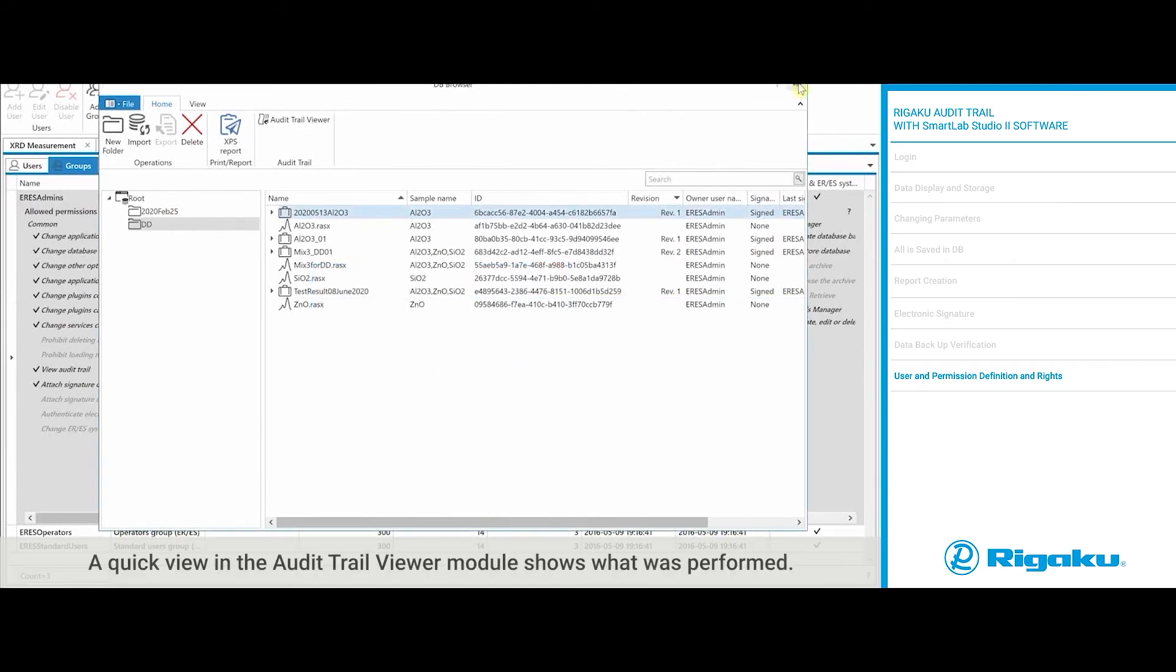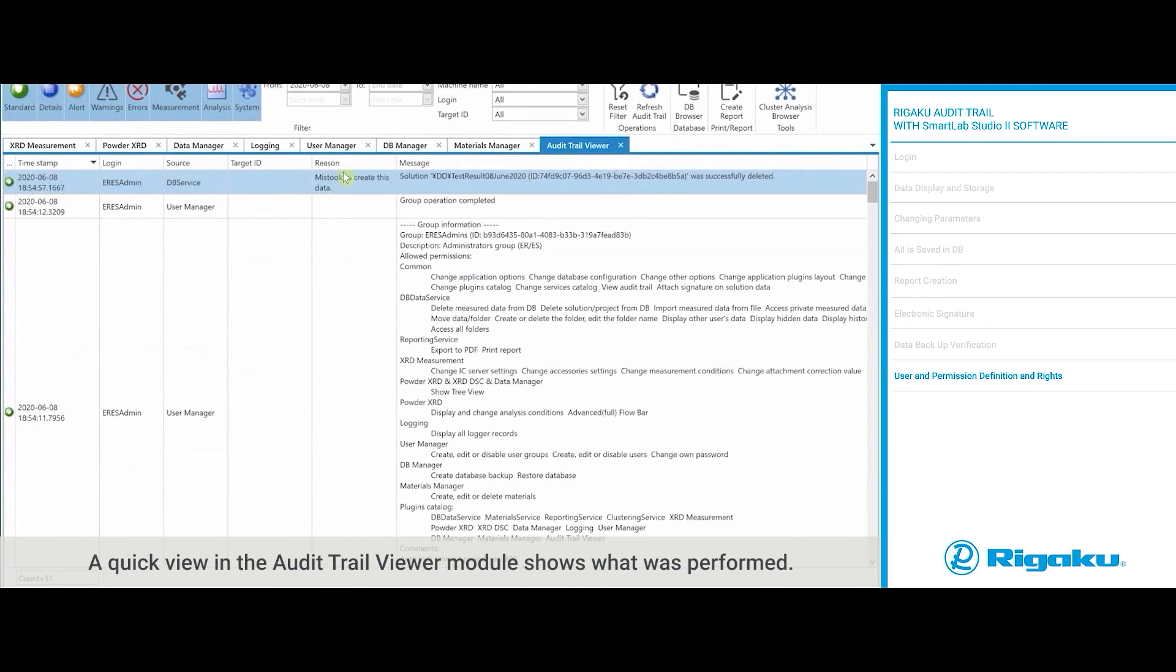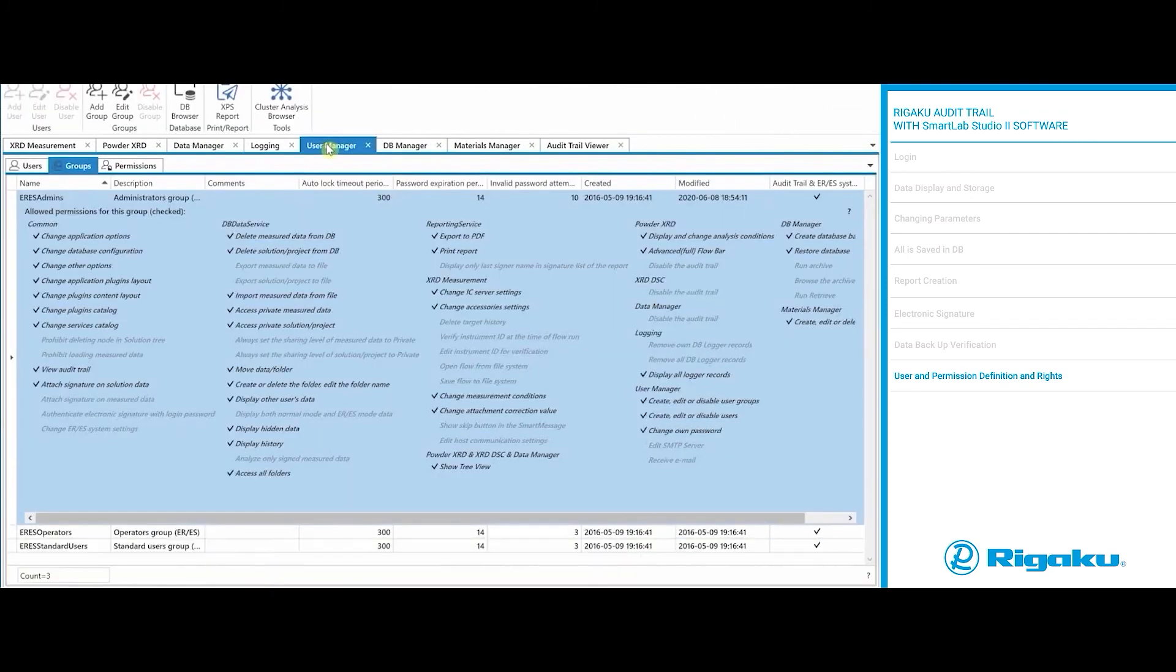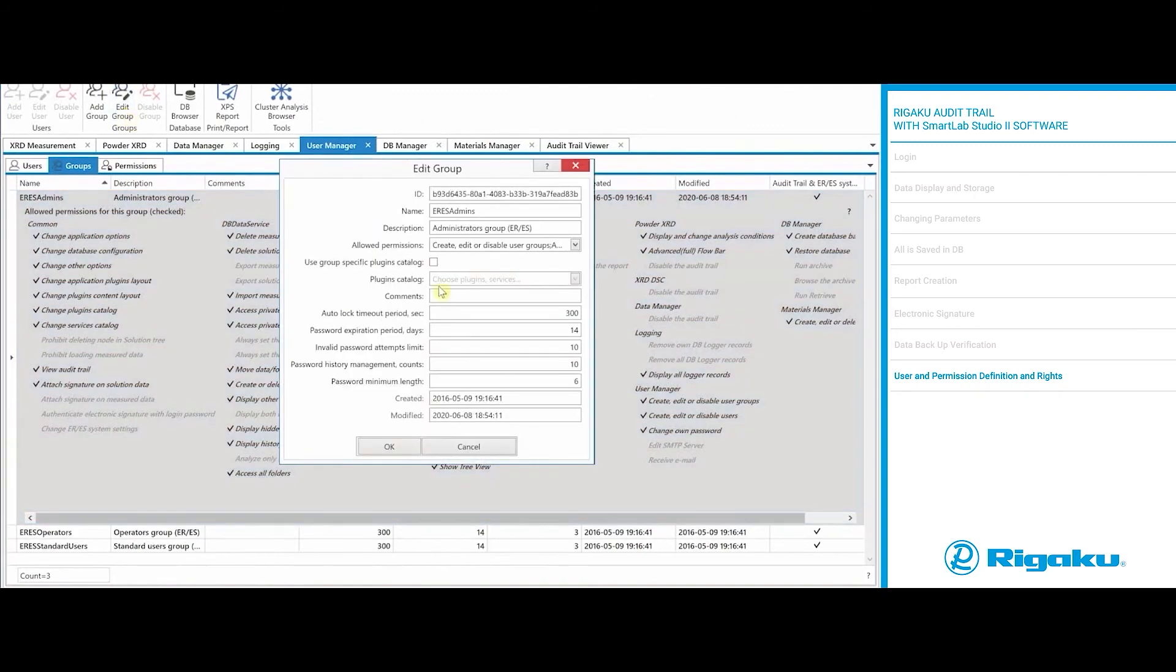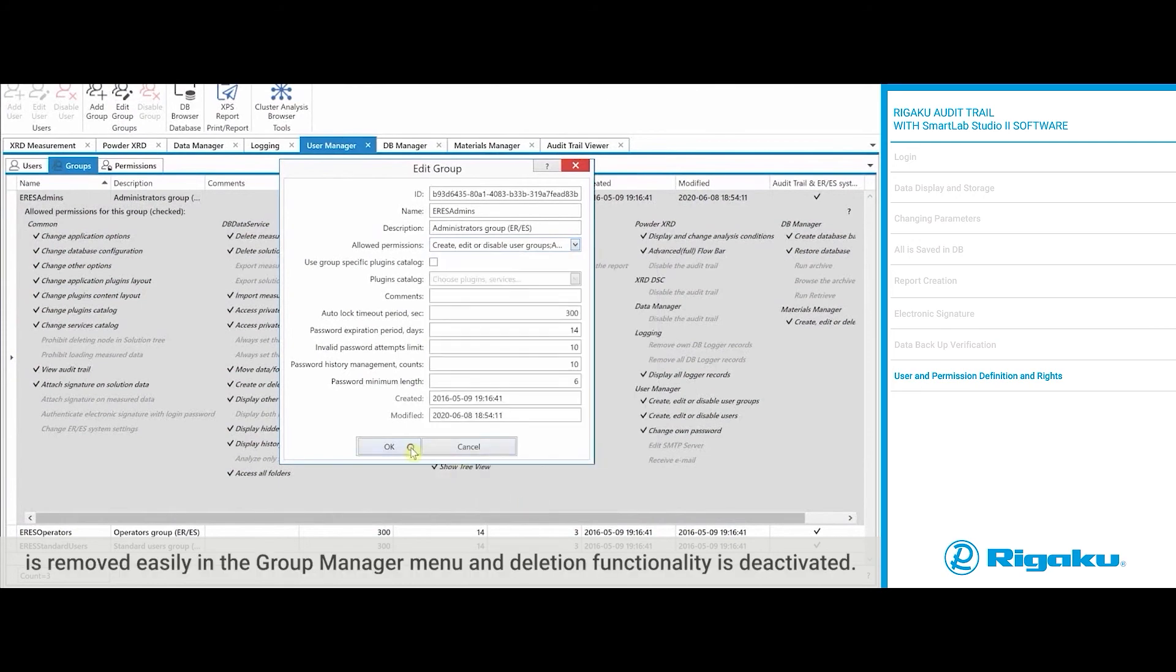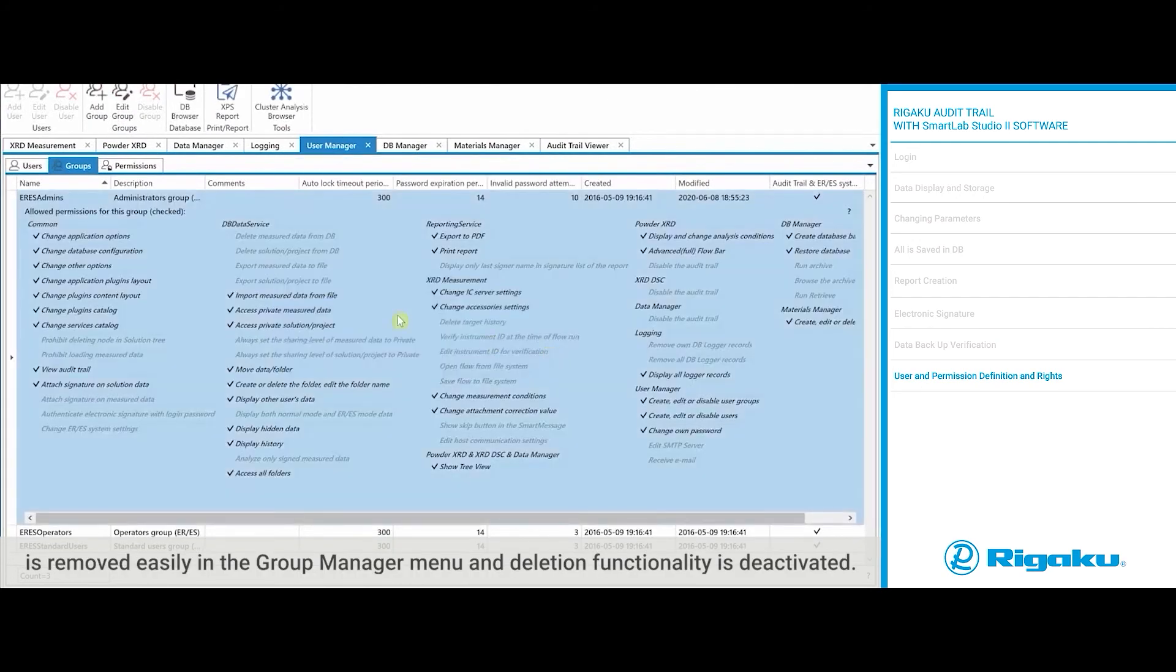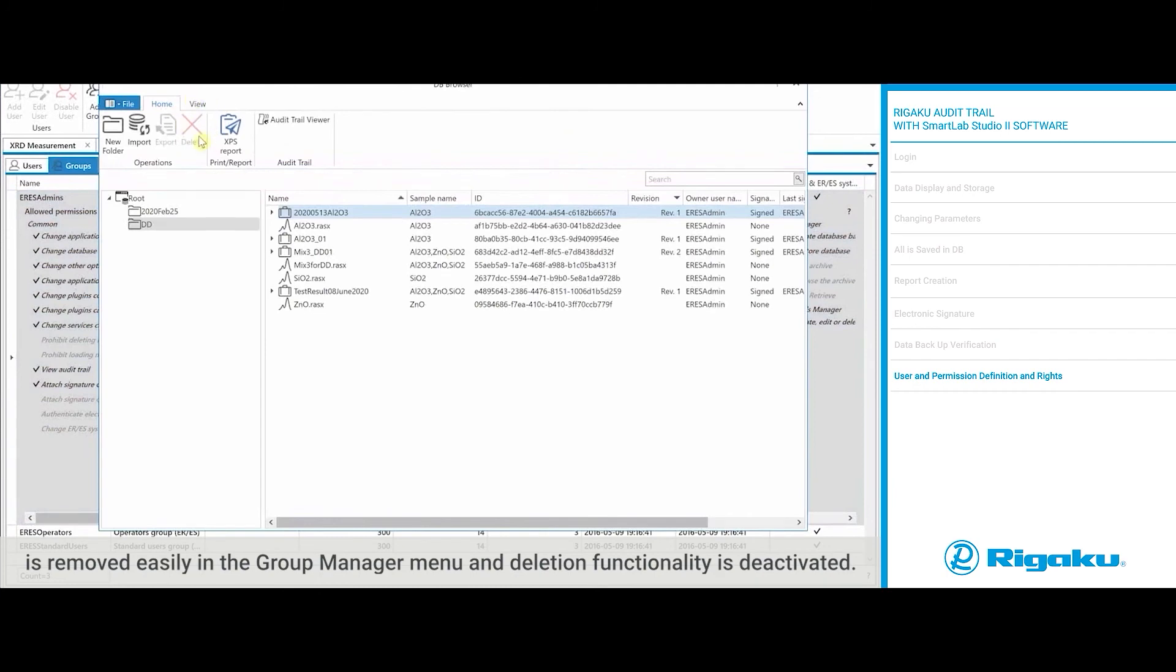A quick view in the audit trail viewer module shows what was performed. After this one can see that the right for the data deletion is removed easily in the group manager menu and deletion functionality is deactivated.